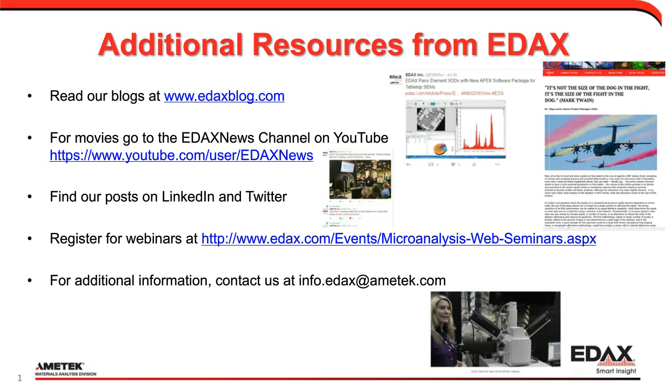I said an error there. You had actually mentioned 0.01%. I answered the question as 0.01%, but I believe I read it as 0.1%. So it is true that about 0.01% is the target that we would say as a minimum detection limit. With silicon drift detectors, you'll achieve more statistics more quickly, and so your error percentage will be reduced for that mean detection limit and also for your mean analyzable limit.